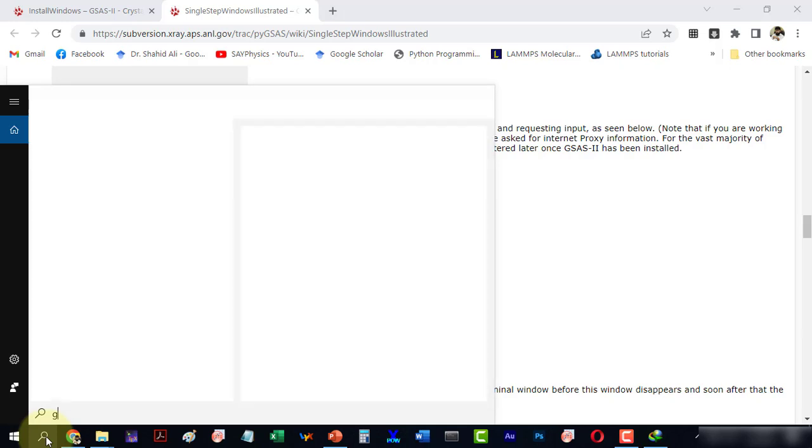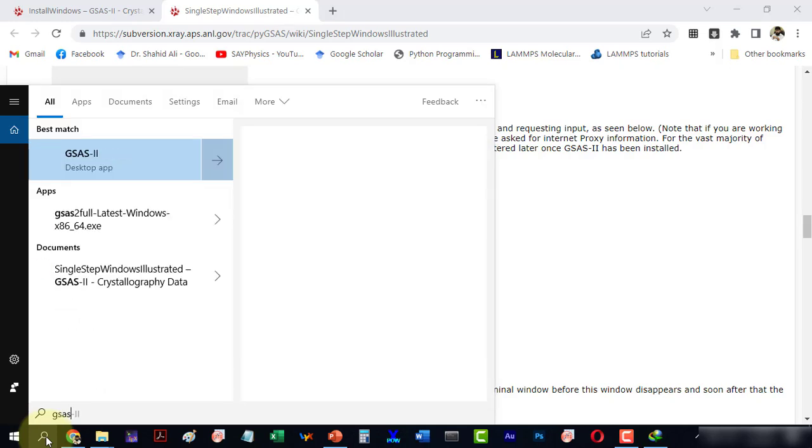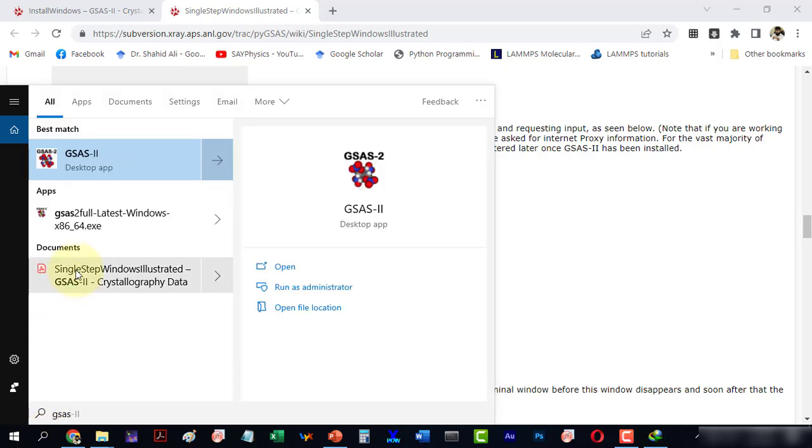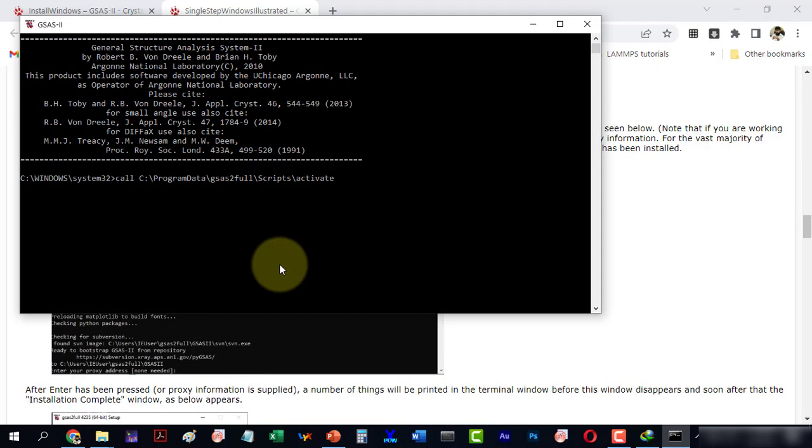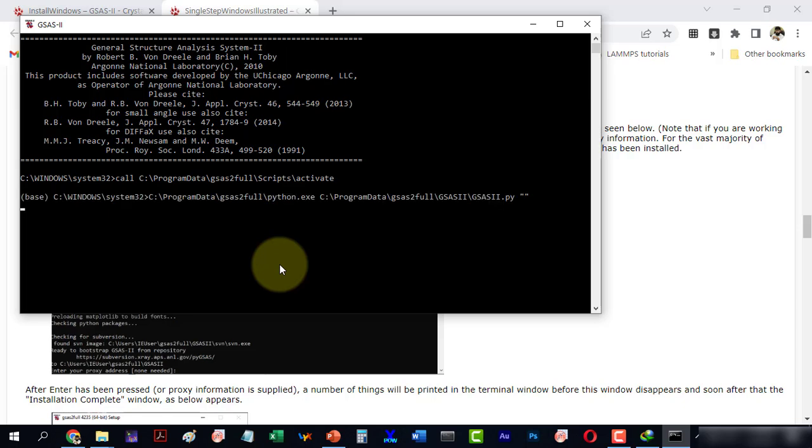To run the software, go to the start menu and type GSAS 2 to start the GSAS 2 software. This is the base window that will appear first and it will activate GSAS and Python.